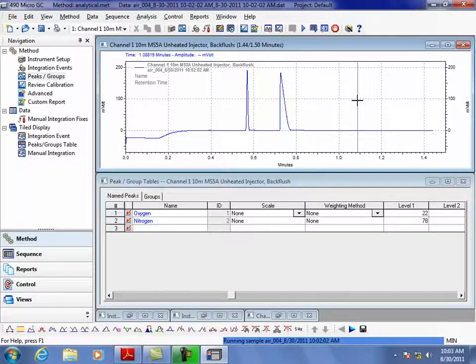If I wanted to do 1%, and this was my range, 100 to 1, I'd get a calibration gas that was probably about 10%. So I'd do 10, I'd force it through 0, and then I'd be looking at here, and that's a fairly straight line, and 1% would be valid, and even 100 ppm might be valid, pretty close.